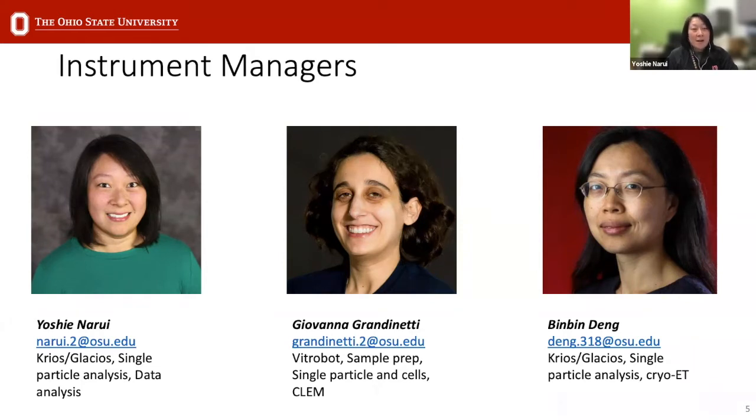I'm on the left there, and I mainly work with setting up single particle data collections on the Krios. I also help people that are screening on the Glacios. And mainly, I would say I try and do more of the data analysis side of things, so trying to keep up to speed with what's going on in terms of processing data.